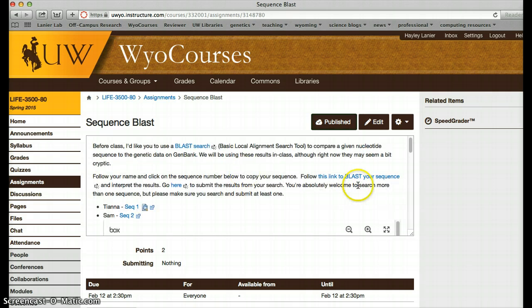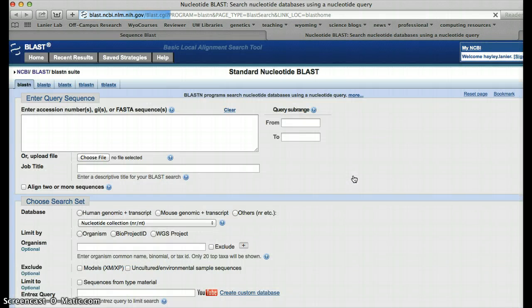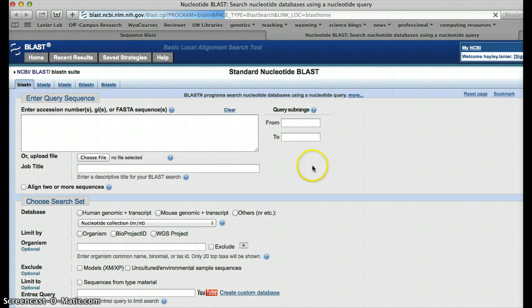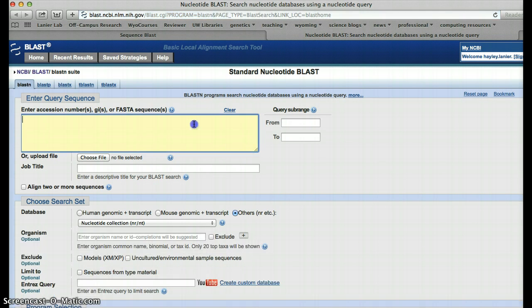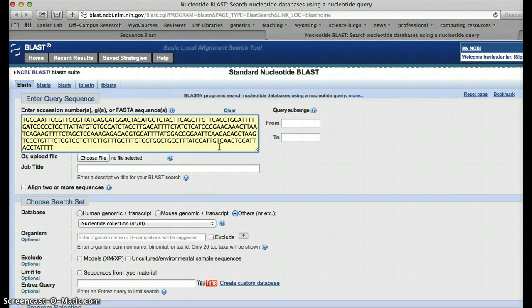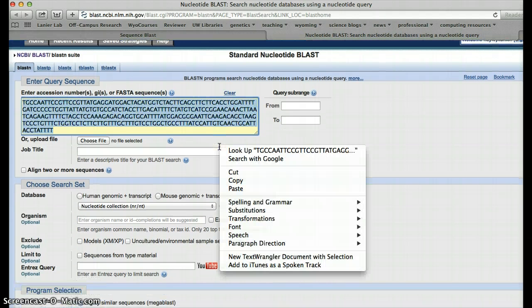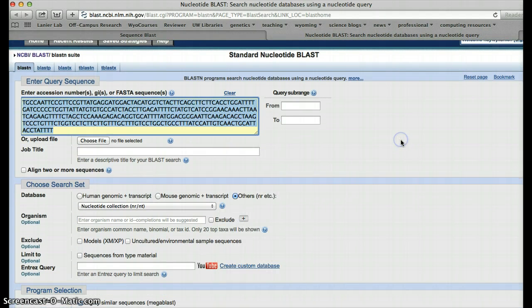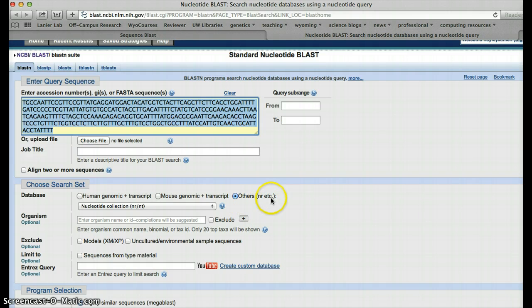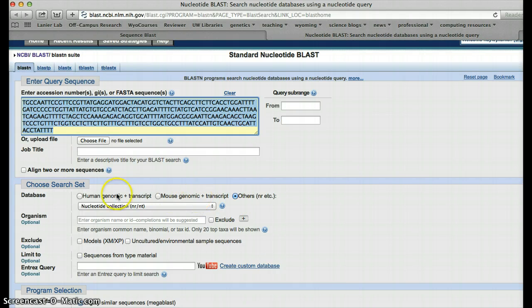Once you've copied your sequence, you're going to follow this link here to blast your sequence. So this brings us to a blast query, and you could put any sequence data in here. Obviously, there's just this chunk that you're going to search. What you want to do is paste your data here, make sure others is selected. Basically, others means that we're going to search all the data that GenBank has that isn't a mouse genomic transcript, and that isn't a human genomic data or transcript.